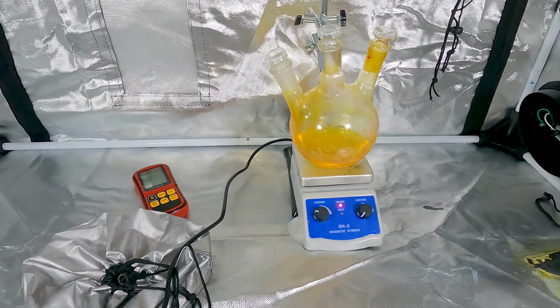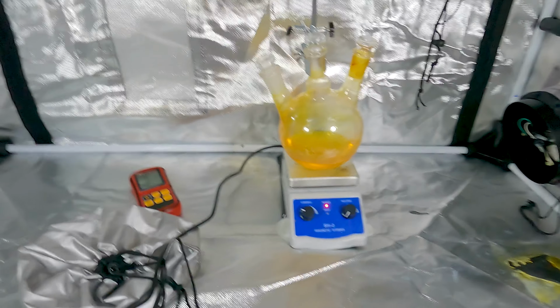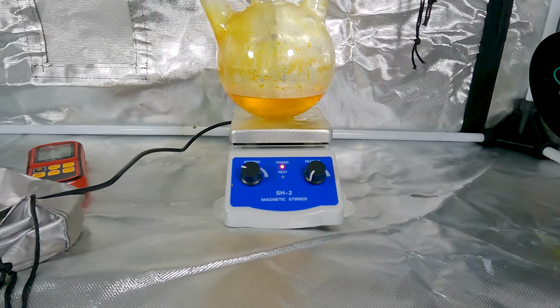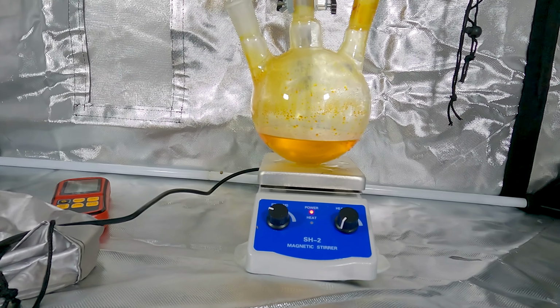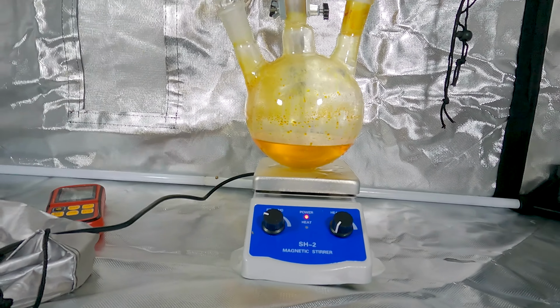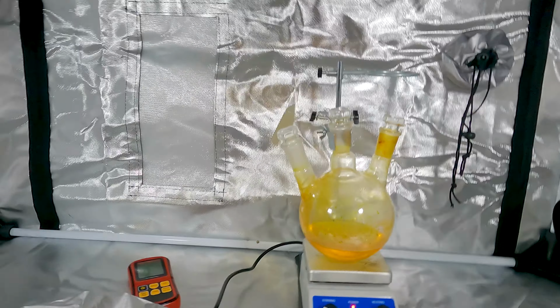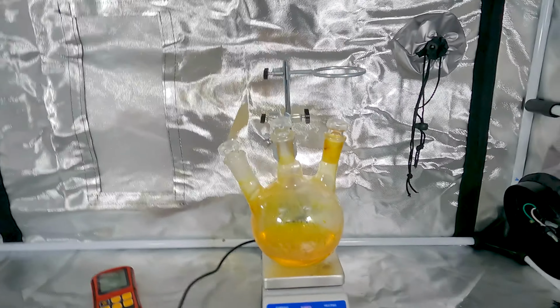So now what we're going to do is stir at room temperature for 20-24 hours, and then why I have this in such a big flask is we're going to add a bunch of sodium hydroxide and methanol, and then we will reflux for another 20 or 24 hours. So long process for this step, but we're kind of doing two in one. This is the first step, tomorrow's the second step.